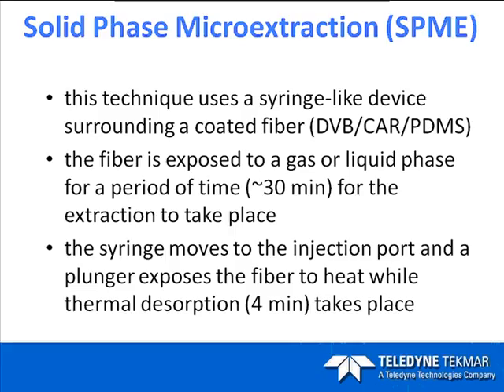For SPME, or solid phase microextraction, this technique uses a syringe-like device surrounding a coated fiber of DVB, which is divinylbenzene, carboxen, and polydimethylsiloxane. The fiber is exposed to a gas or liquid phase for a period of time. That time, depending upon the range of the analytes that we are looking at, can be anywhere from maybe 20 minutes to 120 minutes.